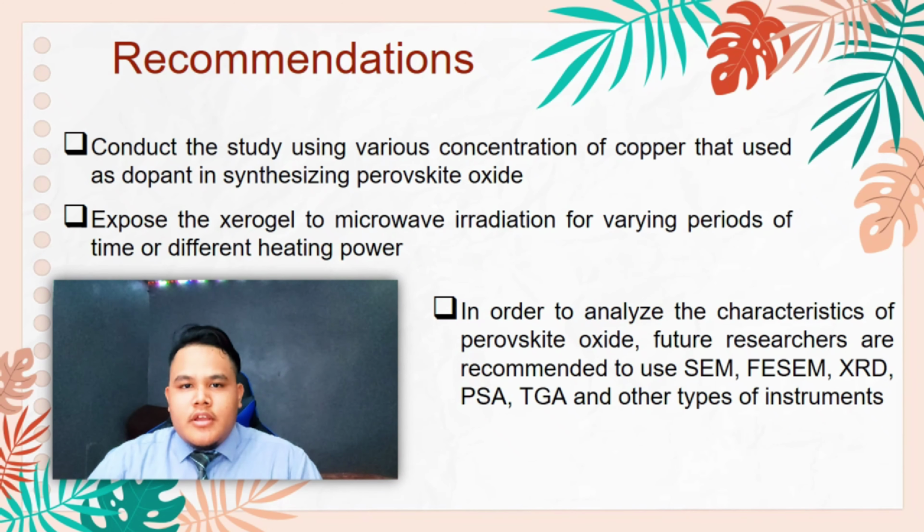As the recommendation, future researchers who want to focus on preparing perovskite oxide are recommended to conduct the study using various concentrations of copper as a dopant. It's also a good idea to expose the dried gel to microwave irradiation for varying periods of time or different heating power.